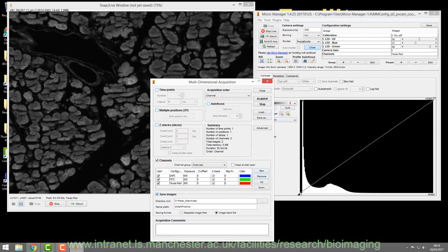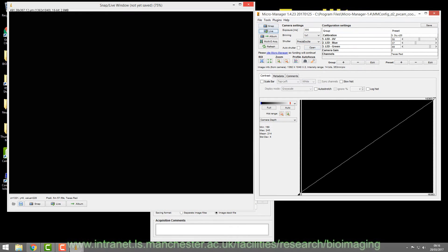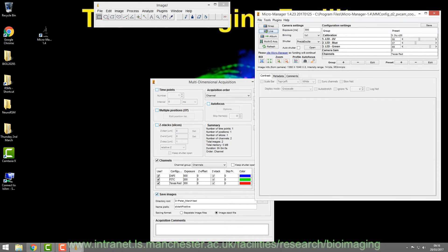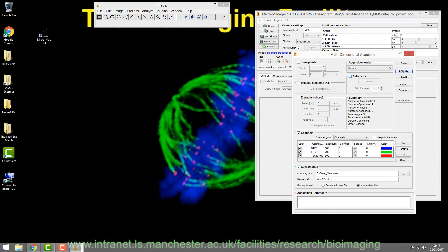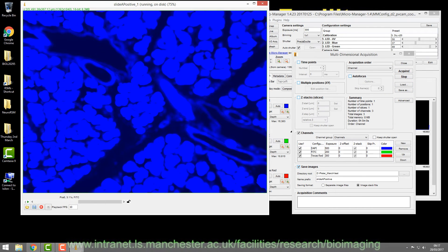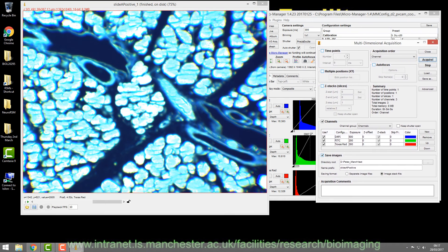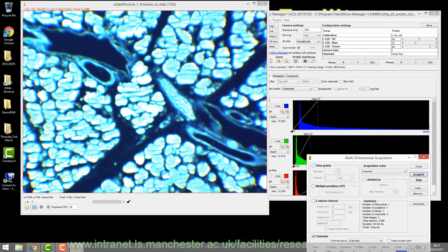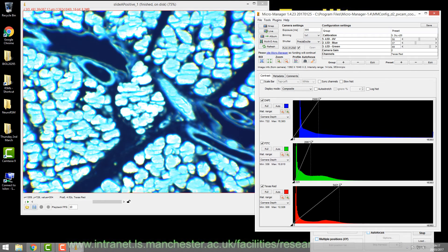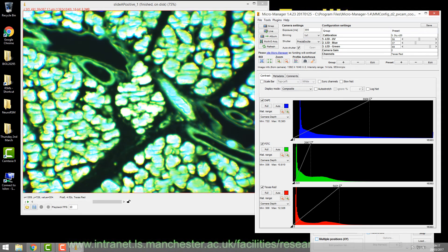We've defined the exposure time for each channel. Close the shutter and stop live. Now we want the computer to take control to acquire the image set. Hand control over by ticking 'Auto Shutter'. When you press Acquire, the microscope moves through each channel individually and takes the blue, green, and red images. At first it may look completely saturated, but check the histogram to see what's actually going on.